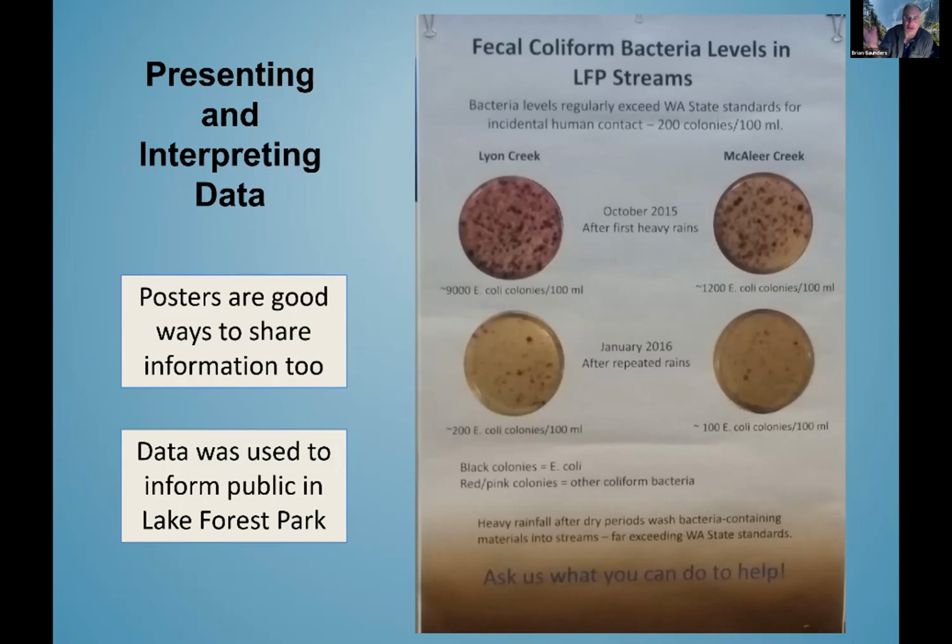What if you stuck it in the freezer or something? I know that's not what we want to do here, but I'm just thinking that if something came up and all of a sudden you had to go somewhere, would that be acceptable? Would you be able to count it? I don't know, that's a good question. I haven't really had that come up. I have kept samples in the freezer sometimes when I found some really remarkable results, and I wanted to share it later with some volunteers to show it to them. So you can do that. I don't know how that would affect your count. Okay.